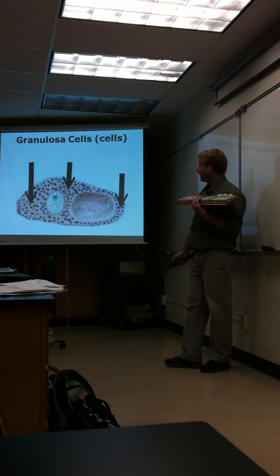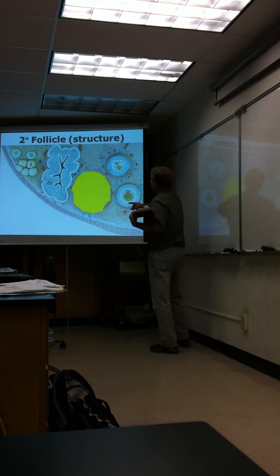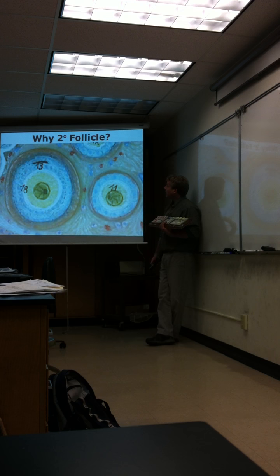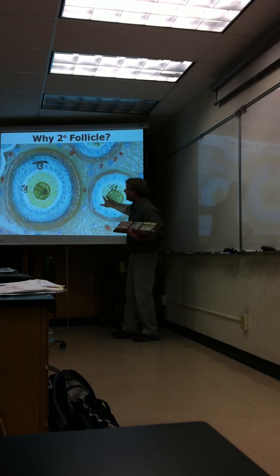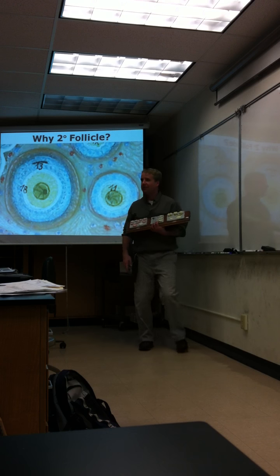The cells there are still the granulosa cells. And this is that other model, and you probably labeled this a secondary follicle. And now if we look closely, primary follicle here, secondary follicle here. Why would this be a secondary follicle in that model?